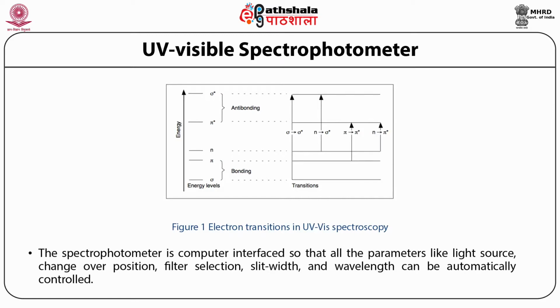The spectrophotometer is computer interfaced so that all the parameters like light source, change over position, filter selection, slit width and wavelength can be automatically controlled.